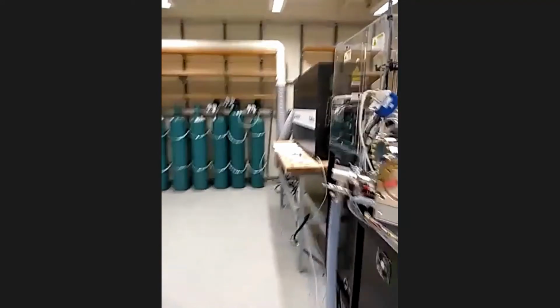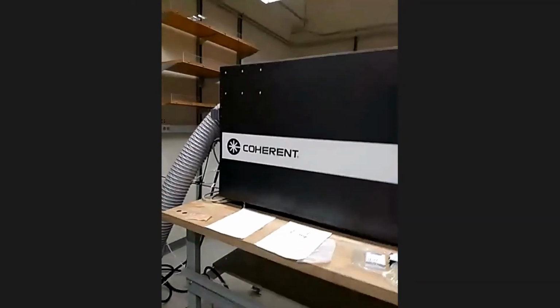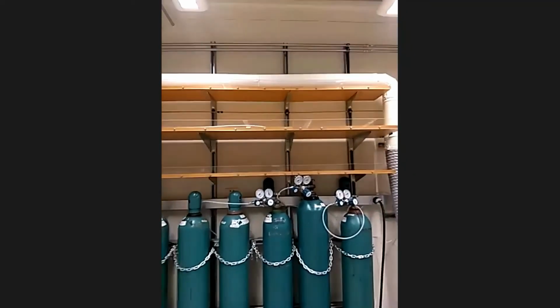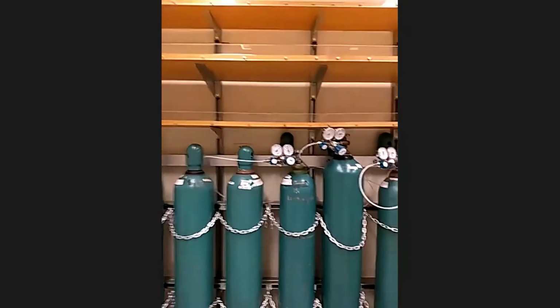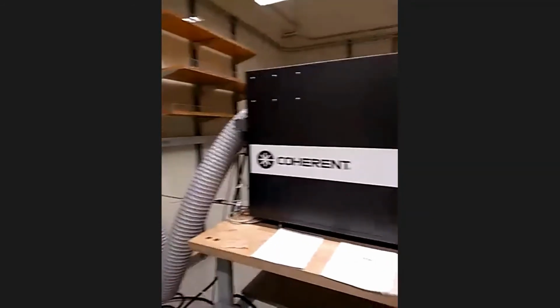This is a krypton fluoride laser, KrF laser. So it needs krypton fluoride gas, which is unhealthy to inhale, so it's totally inside a safety enclosure. The rest of the gases are nitrogen and helium, and there is also the compressor.